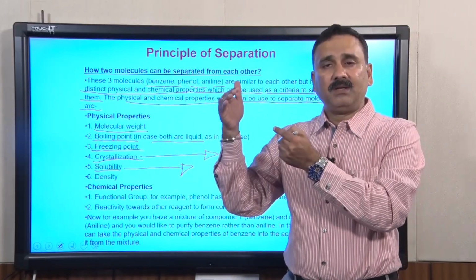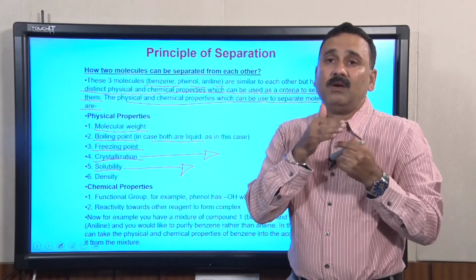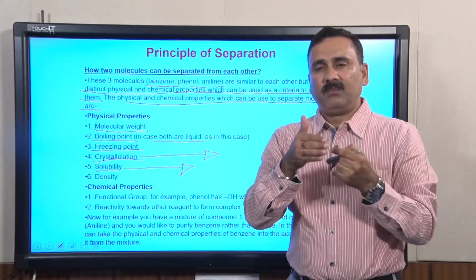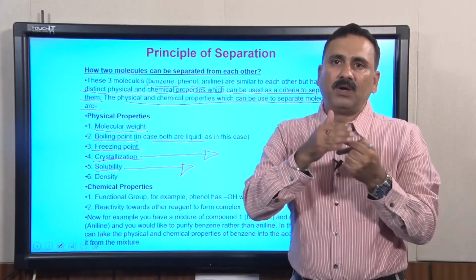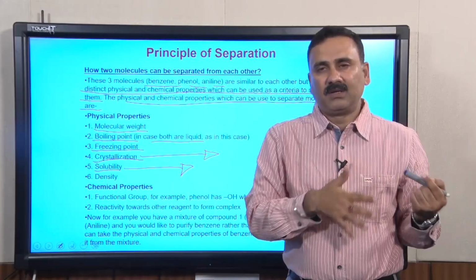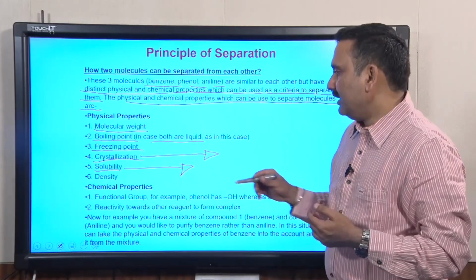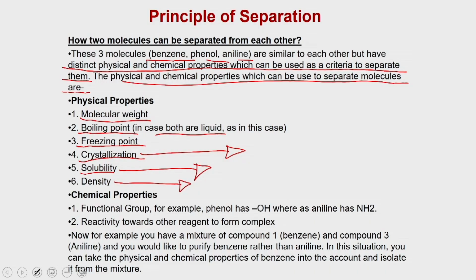The DNA, which is a polar molecule, was migrating to the aqueous layer, whereas the protein and all other molecules were going into the phenol layer, and that is how you were separating the DNA from the protein as well as the other contaminating molecules. So, that can be used as a criterion to purify the molecule as well. Then you can also use density.